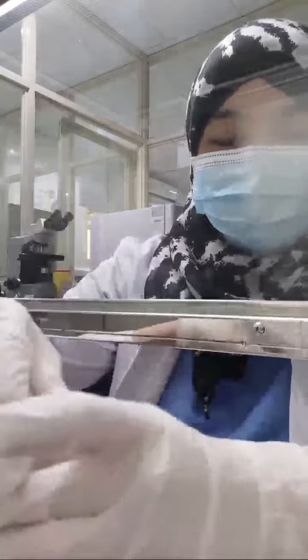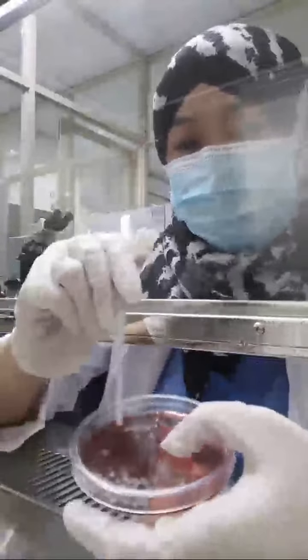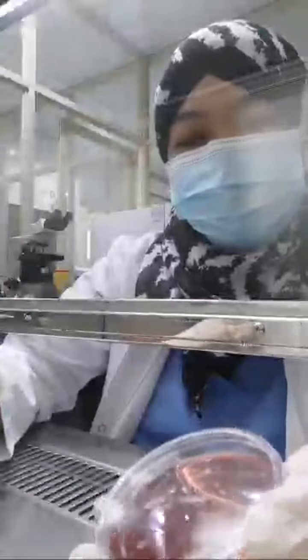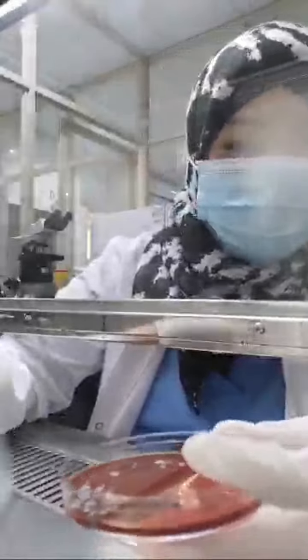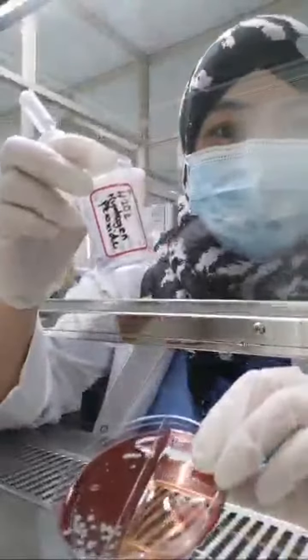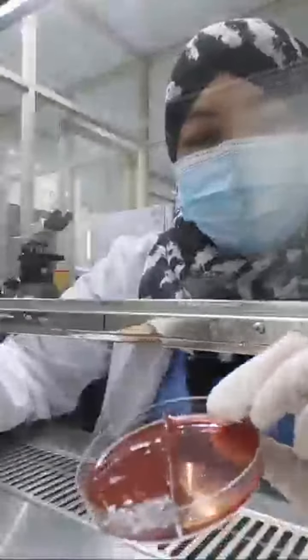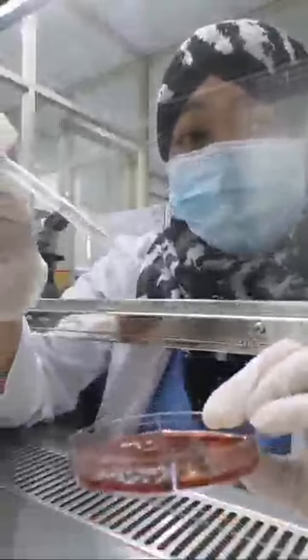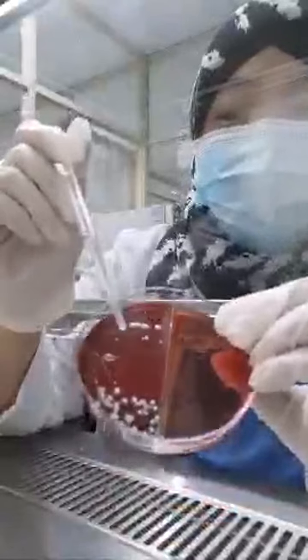This one is finished. So what I will do is I will just add some so that you can see a lot of bubbles. This test is called the catalase test. This is hydrogen peroxide, or H2O2. This is what we put on wounds. So if you put it on your wounds, there will be bubbles, which means that there is bacteria on your wounds.